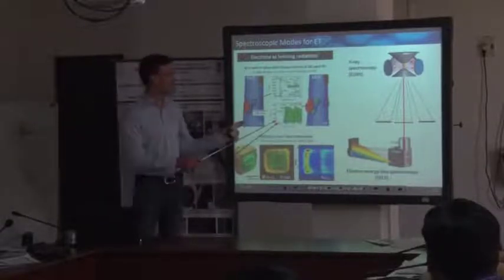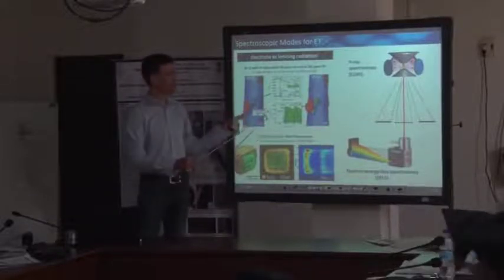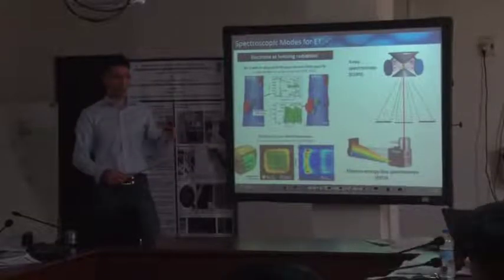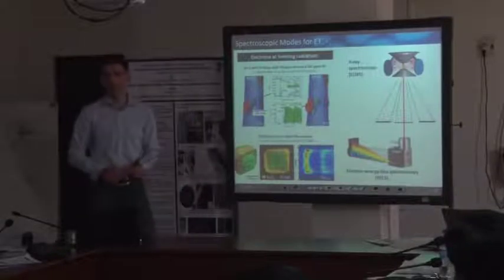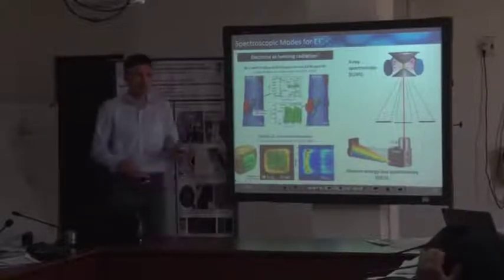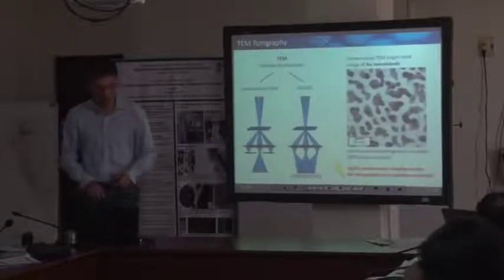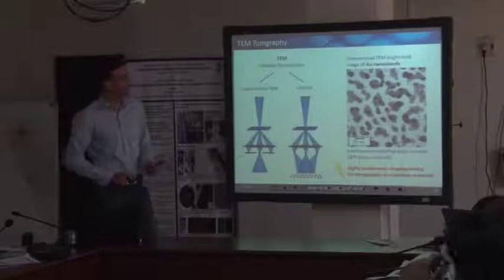You just have to think about how to quantify your data, because you probably want to use quantified data, not just the signal distribution, but quantified data along the different directions to go for a reconstruction of the elemental distribution of the material. But even in energy filtered TEM, you can use almost any signal that in principle fulfills your projection requirement. And this is the problem about conventional TEM bright field imaging.